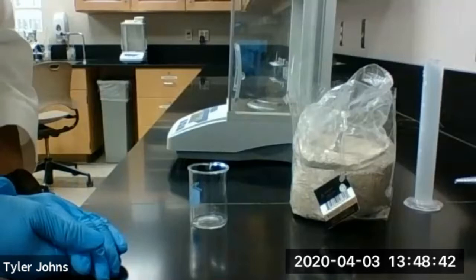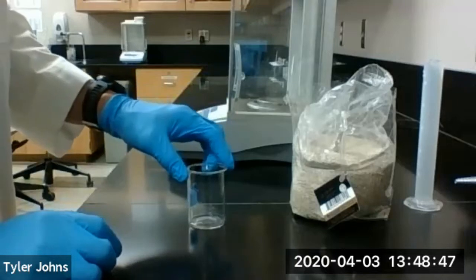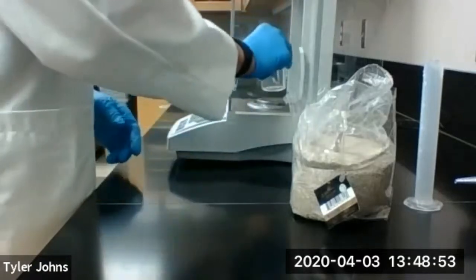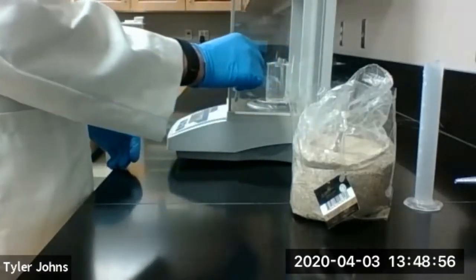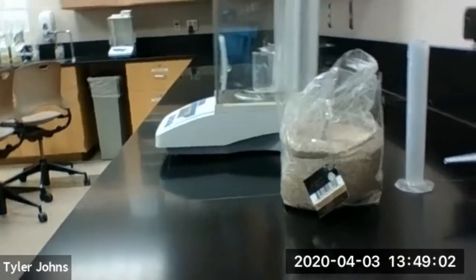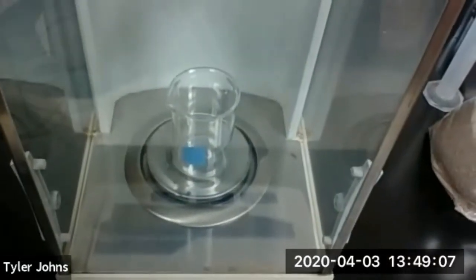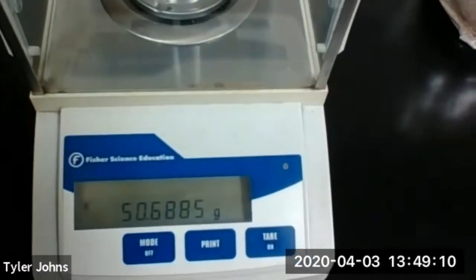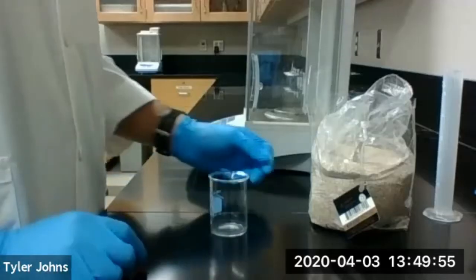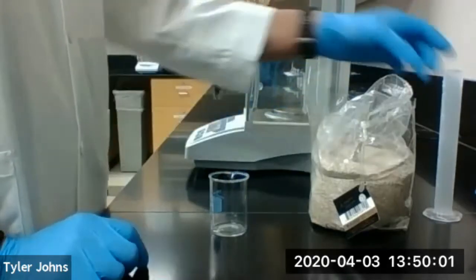Okay, so in part B of this experiment, we're going to count by mass using sand. So first we need to determine the mass of an empty 100 ml beaker. The mass of our empty 100 ml beaker is 50.6885 grams.